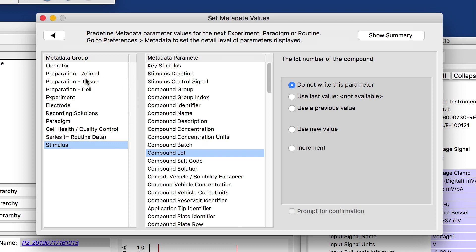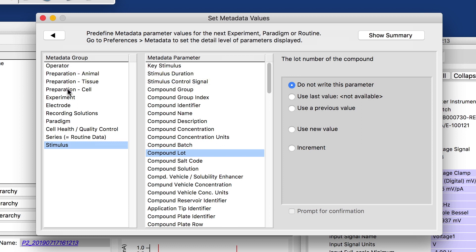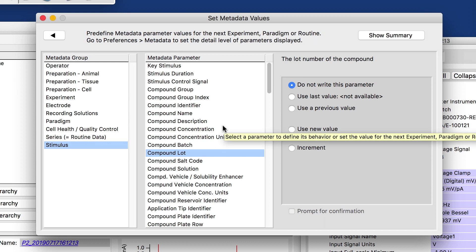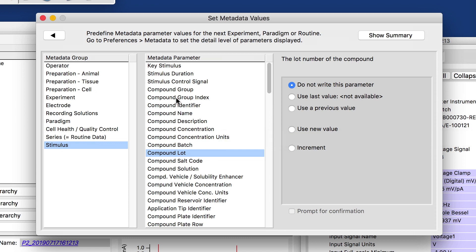Nobody would populate all 600 and some meta parameters that we have right now and then around midnight start the experiments finally. But the idea is to give you a structured place to store the data that you think is relevant for your particular type of experiment.